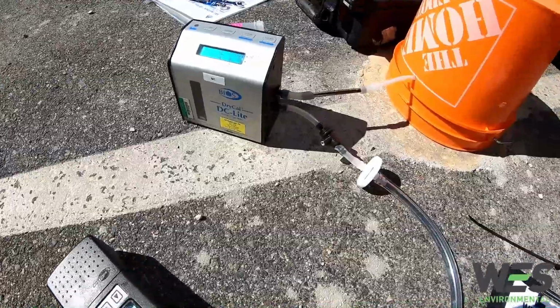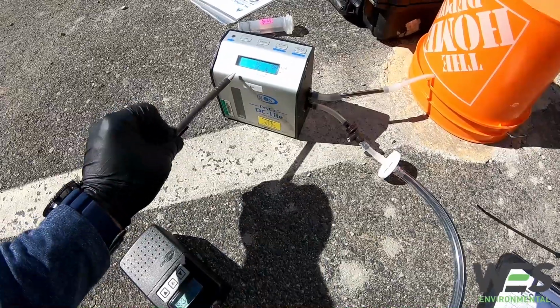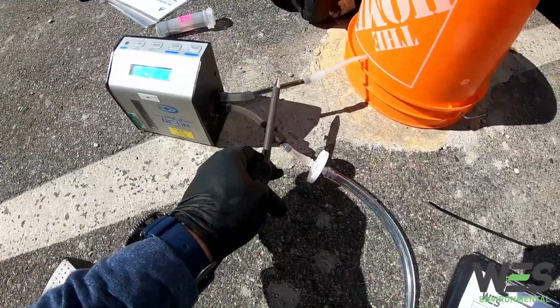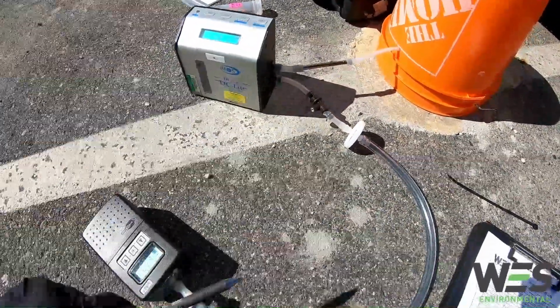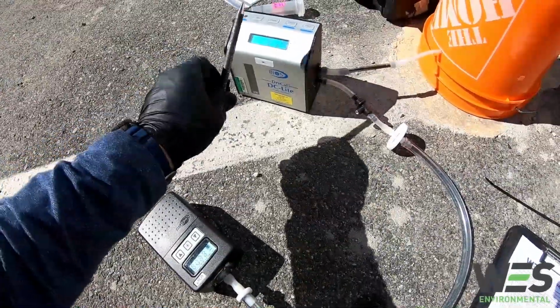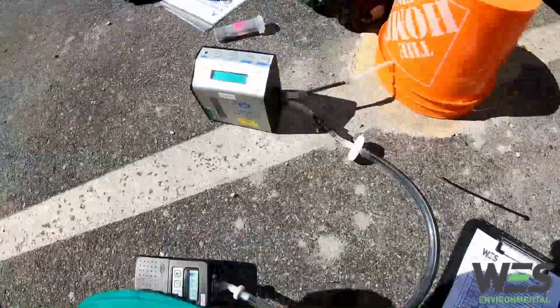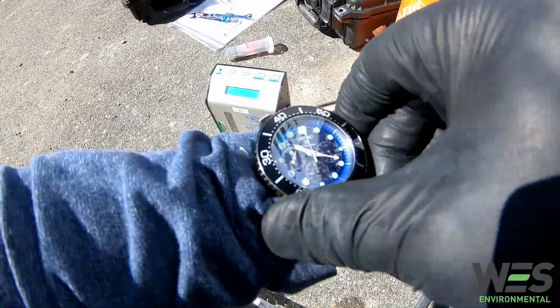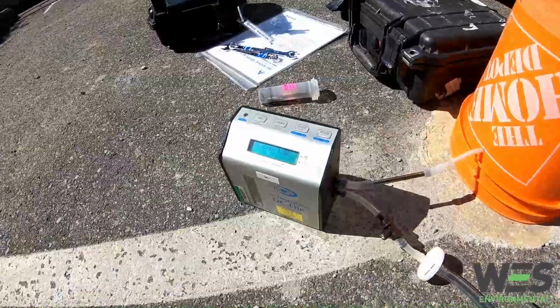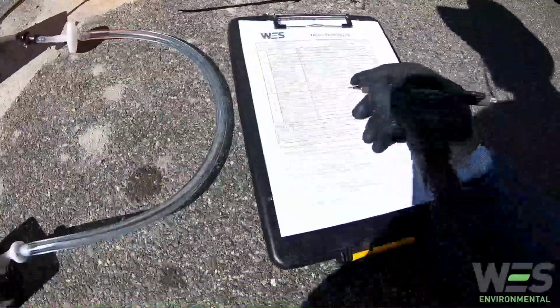I'm gonna make sure that I time this correctly. So we already know that it's going to draw at about 100 milliliters a minute. I want 500 milliliters of air to pass through here. So I'm going to time it for pretty much exactly 5 minutes. And then I'm going to collect a flow reading at the start and a flow reading at the end and average it out. All right, we're ready to go. Start the stopwatch, start the pump, and start the reader. Nice. So initial reading 101.8 milliliters per minute. That's great.